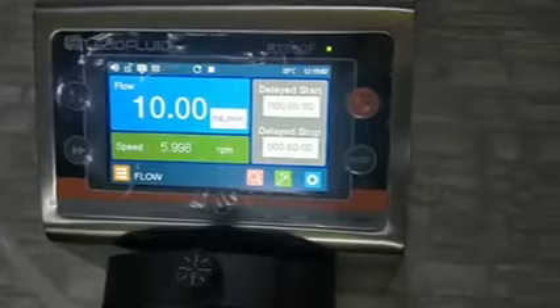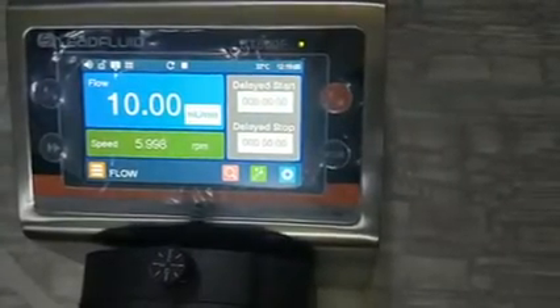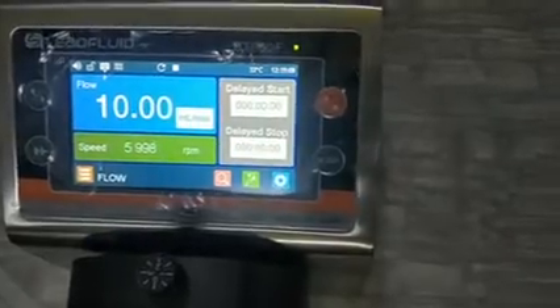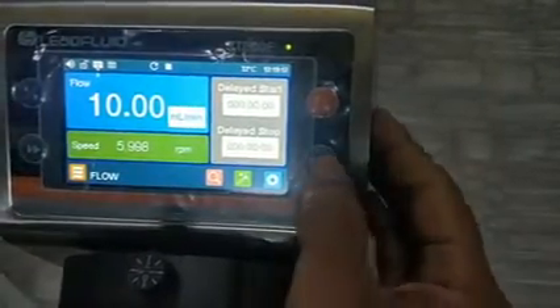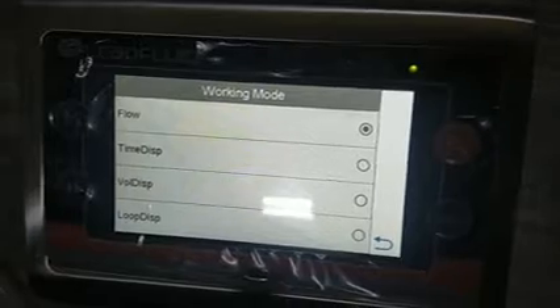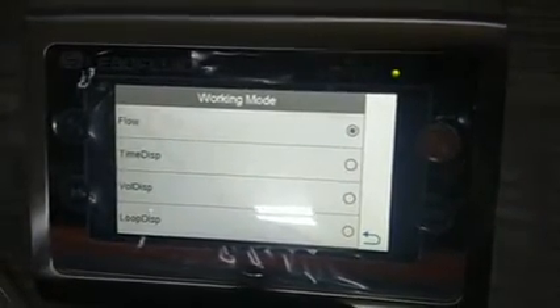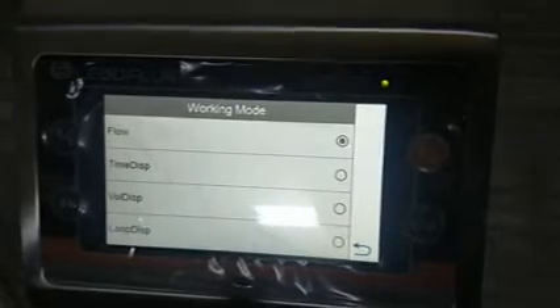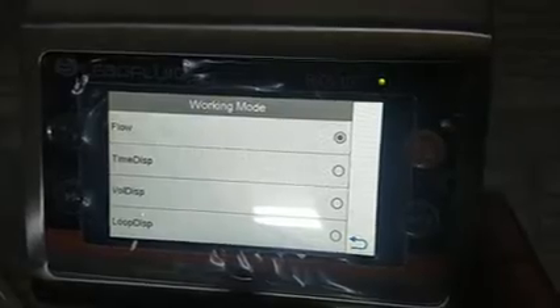This pump has four operating modes: Flow Mode, Time Dispense, Volume Dispense, and Loop Dispense. We will discuss all four one by one. Flow Mode is a very simple mode where you set a flow and the pump continuously runs at that flow. Let's go there.